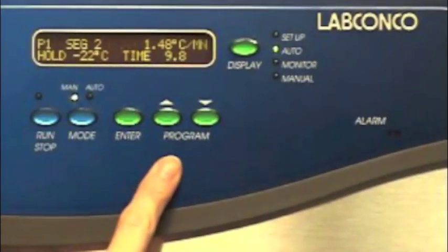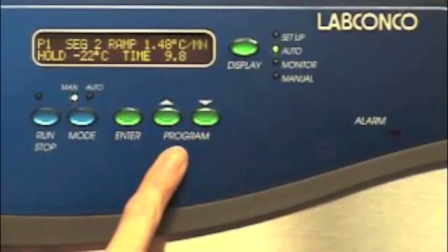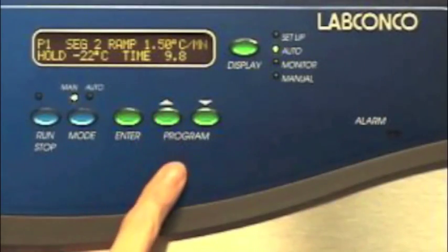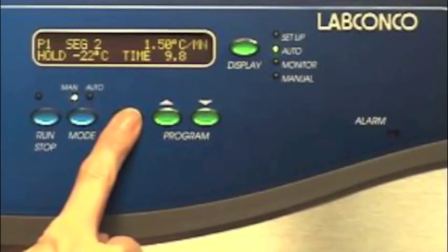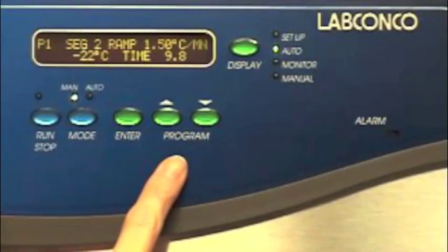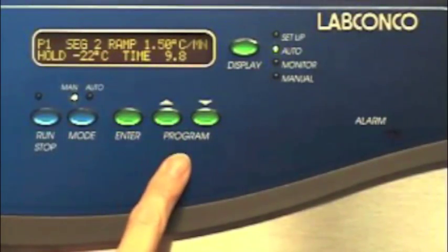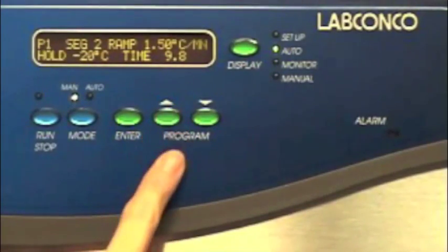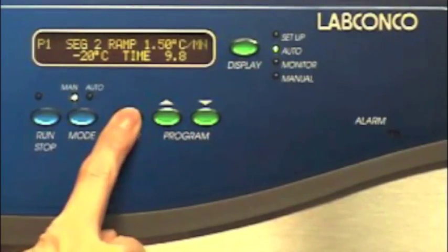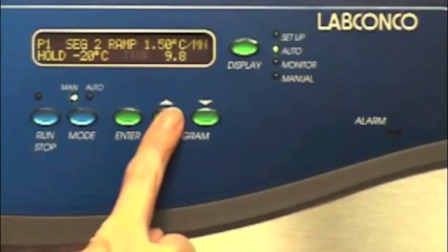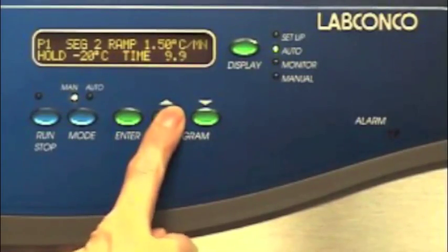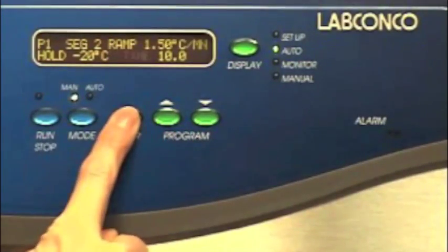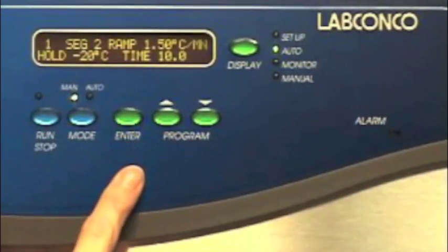For the next segment select two. For ramp select 1.5 degrees centigrade per minute for the shelf temperature increase. For hold select minus 20 degrees centigrade, and for time select 10 hours.